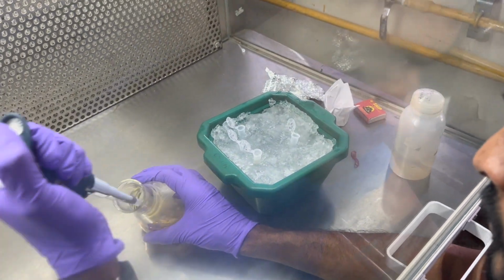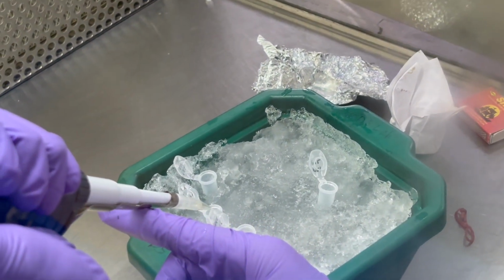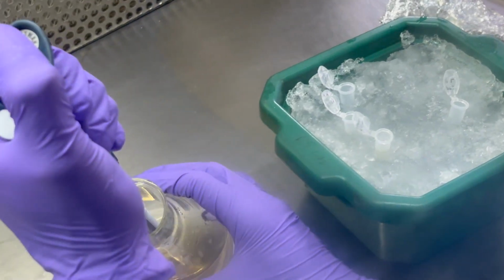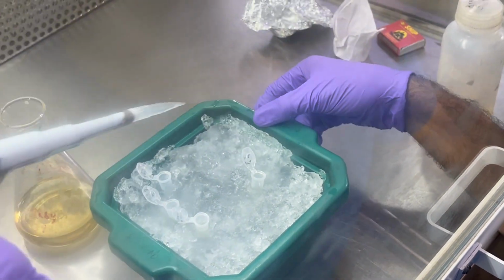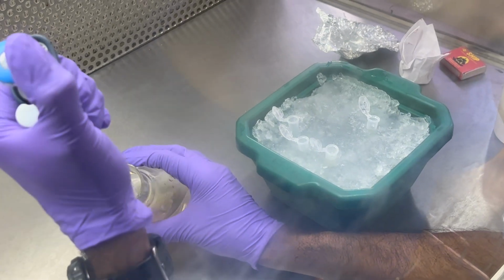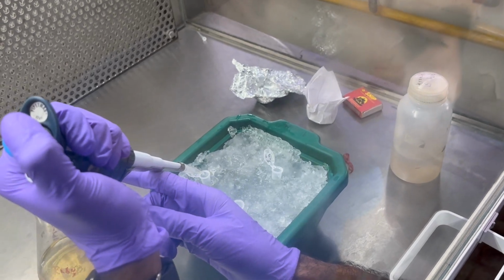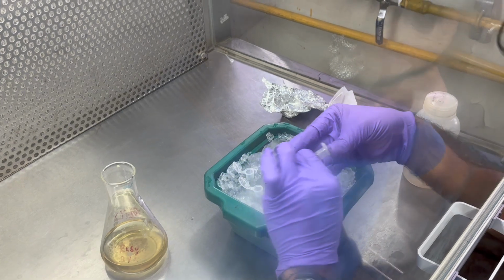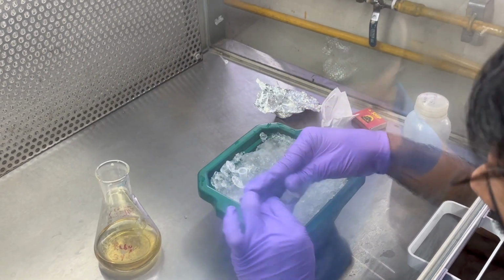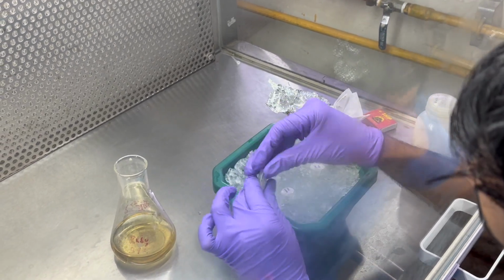Now to give the bacteria a chance to recover from this kind of stress, we need to add LB broth, and we have to keep it for at least 2 to 3 hours at 28 degrees Celsius in case of Agrobacterium tumefaciens or rhizogenes, to allow them to recover from the bacterial stress as well as to express their antibiotic genes. You don't need to change the tip if you are not touching it. If you touch the vials, then you have to change the tip.